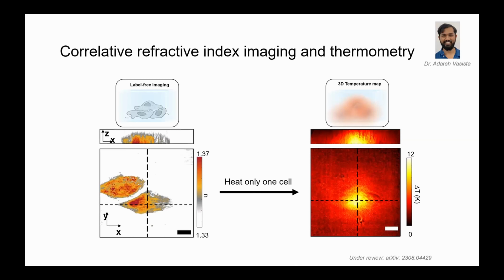And the second question would be, for the time-dependent study, you say that you have a rotating wedge prism which rotates and it takes time, and then you have to focus on each of the k-space points, and in that sense, while it is focusing on the next k-space point, your system has already evolved slightly. And in that case, exactly how does the time dependent measurement work? I was slightly confused about that.